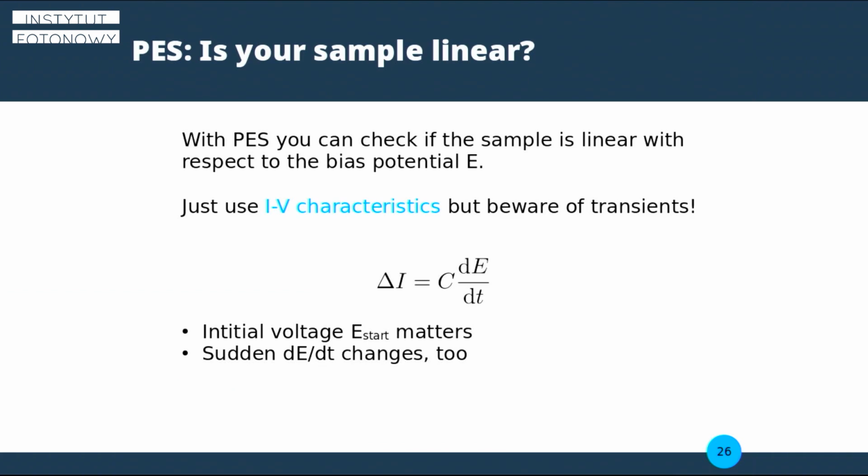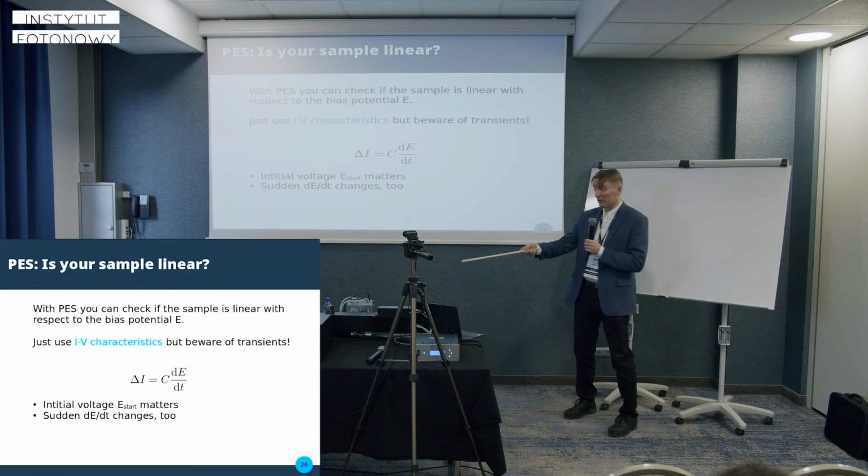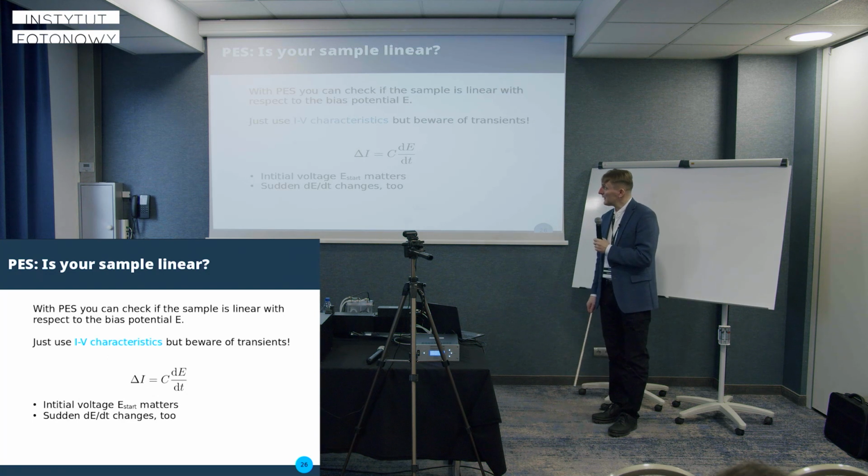Now, since this is a conference about nonlinear phenomena, how can you check if your sample is linear with the photoelectric spectrometer?